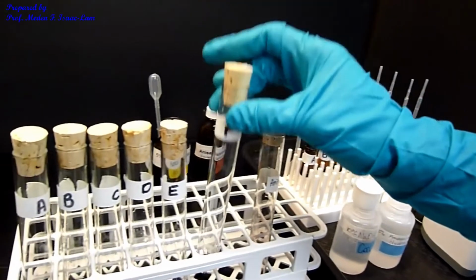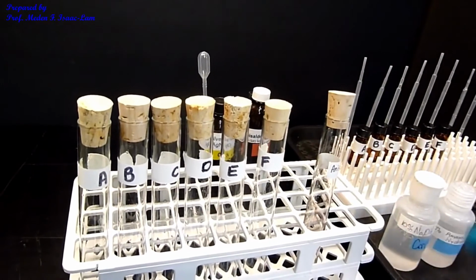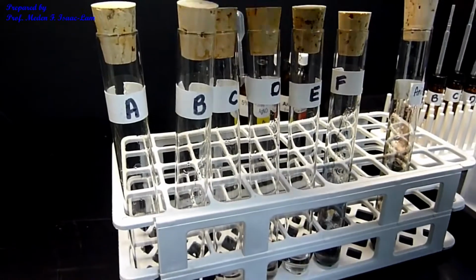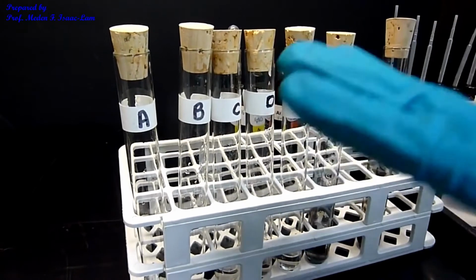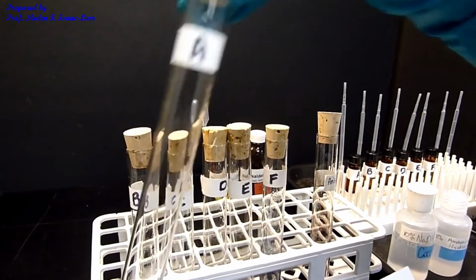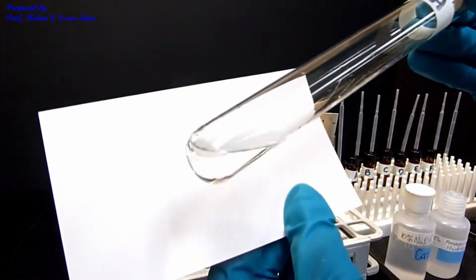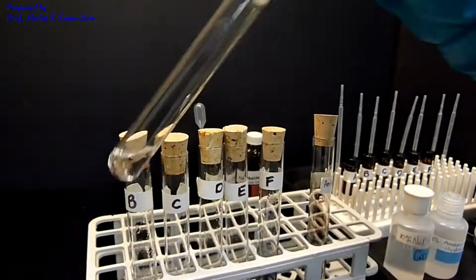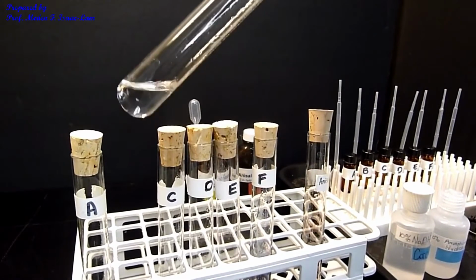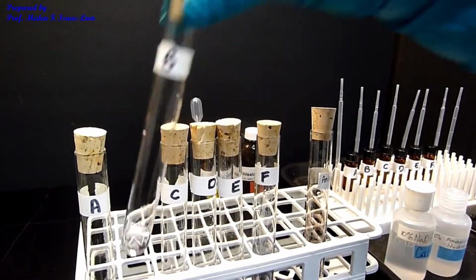So I'm now going to add in each of the tubes 3 drops each of the unknown. So I added all the unknowns in each of the tubes, A, B, C, D, E, F. So this is A. So nothing. Clear. And then this is B. Nothing.